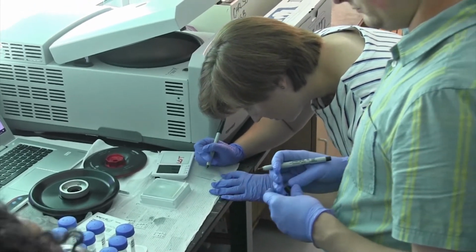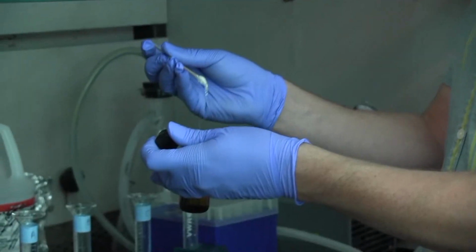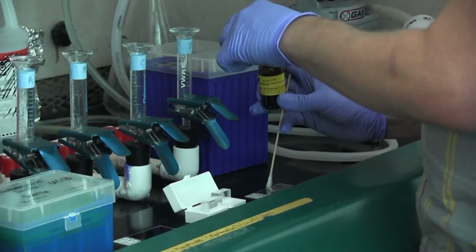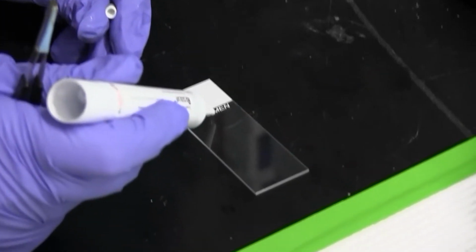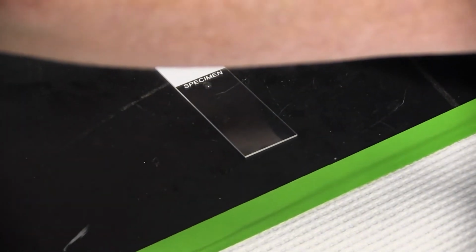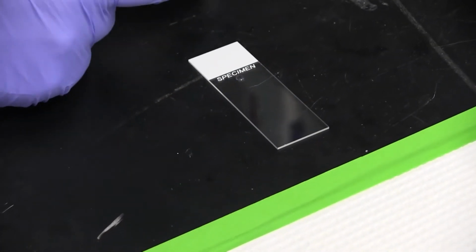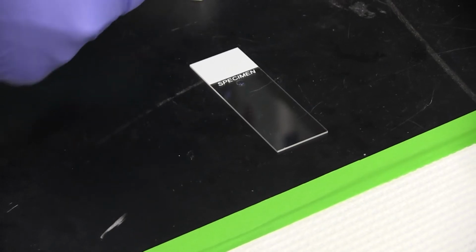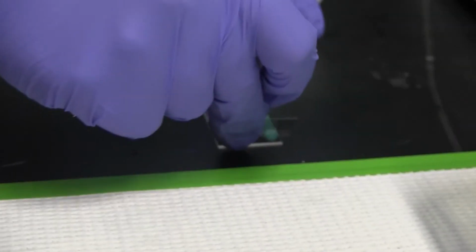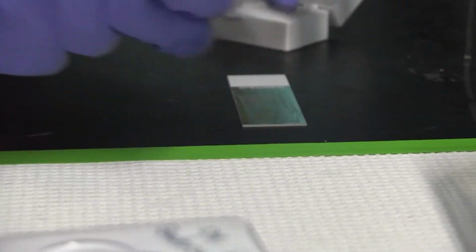We use a high viscosity oil, we smear it on the slide, filters stick to it. They have to remember to keep the filter upright, because if they turn it upside down you don't see the bacteria. And then we put a cover slip on with the high viscosity oil, and you've got to press down. Another thing that the students tend to do is they put 2 cover slips on, so when you're looking on the microscope you can't see anything, but then it's quite easy to just take the top cover slip off.